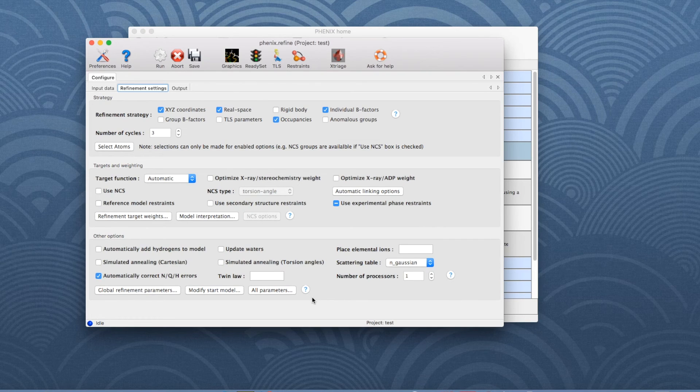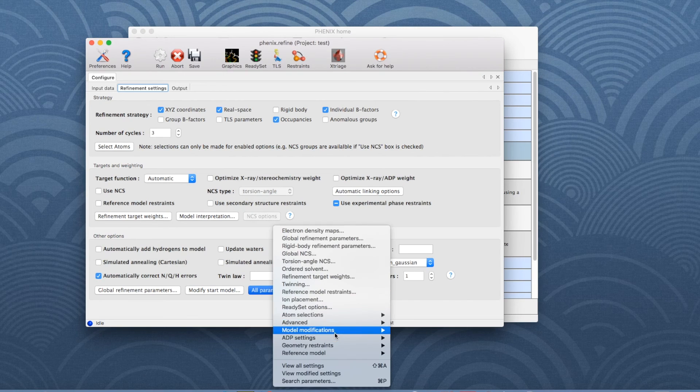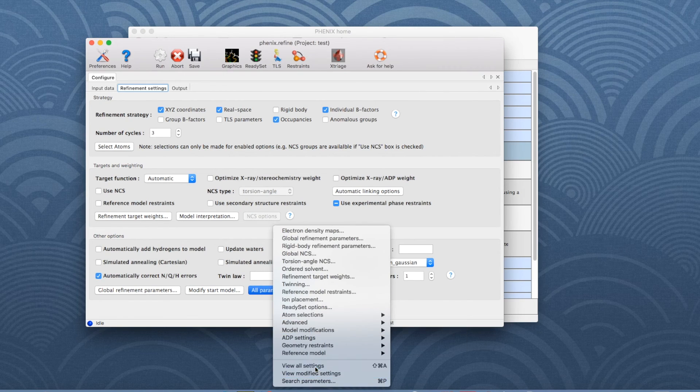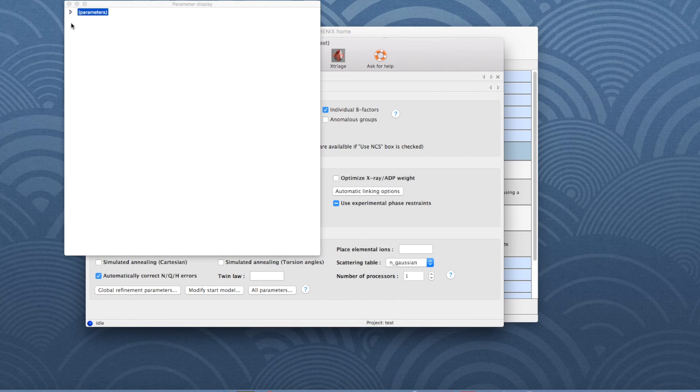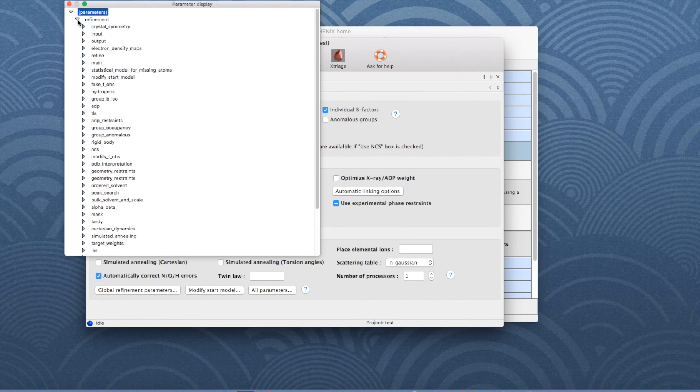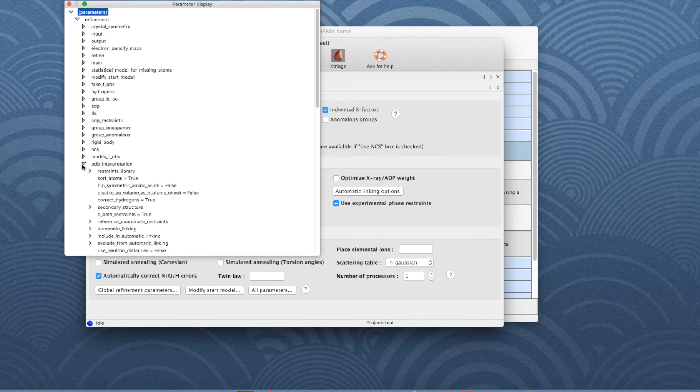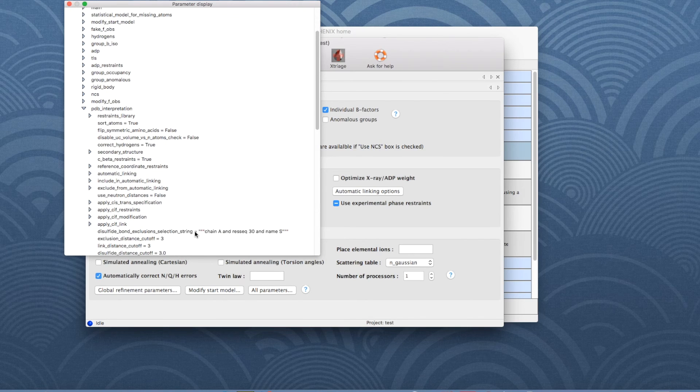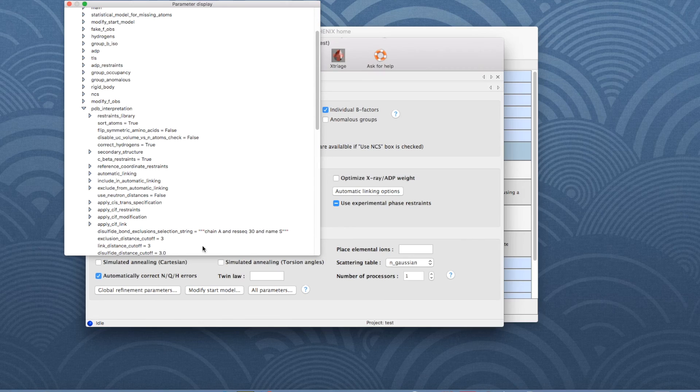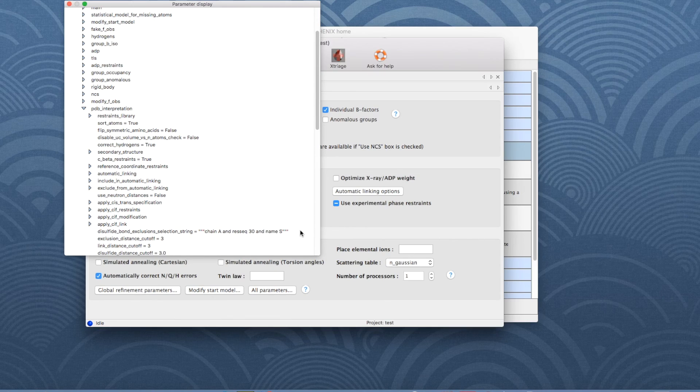If you want to check if the parameter was changed, click on All Parameters and choose View All Settings in the drop-down menu. Our keyword is found under PDB Interpretation. The default value was indeed changed to the selection string I typed previously.